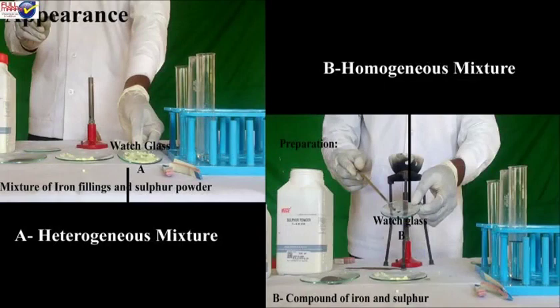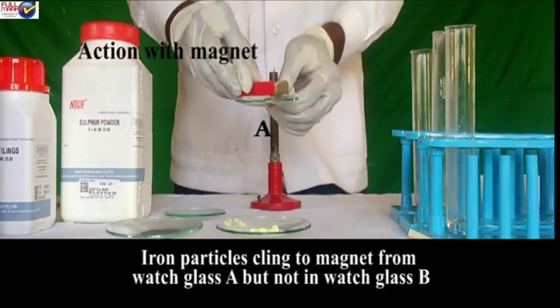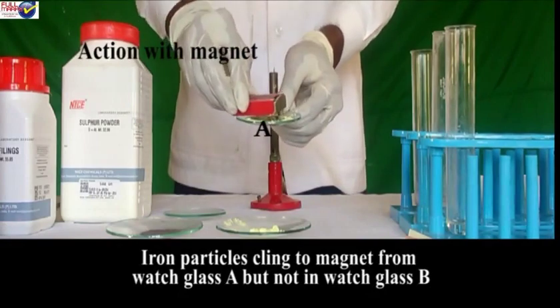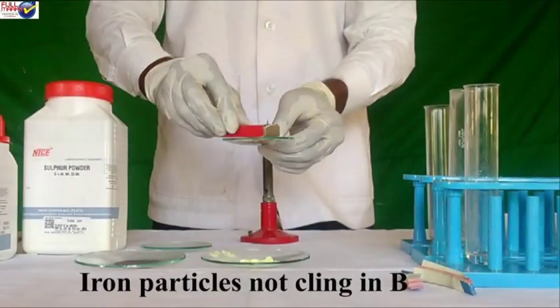Observe for appearance. Watch glass A shows a heterogeneous mixture and watch glass B shows a black mass of homogeneous substance. Action with magnet: a bar magnet is rolled over both the watch glasses A and B. Iron particles cling to the magnet from watch glass A, but not from B.